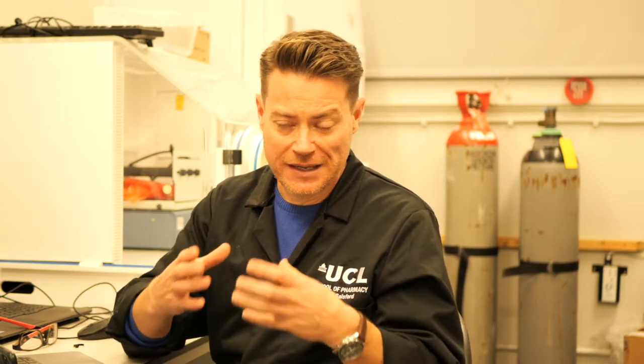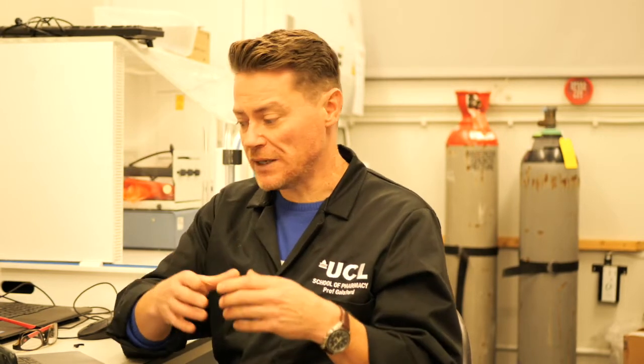SEM or TEM, on the other hand, are blowing up the sample, say 100,000 times, and that's way too much resolution for something really big like a tablet or capsule. You need something a lot smaller. So essentially, the choice of microscope is dependent on the size of your sample, as shown on the table. Powders, tablets, crystals, things like that, large things, are generally imaged with light microscopes because you don't need to go any further than that. You're not looking for really small structures.